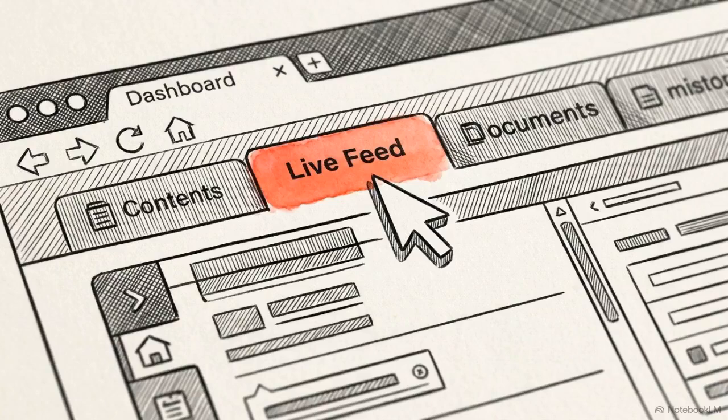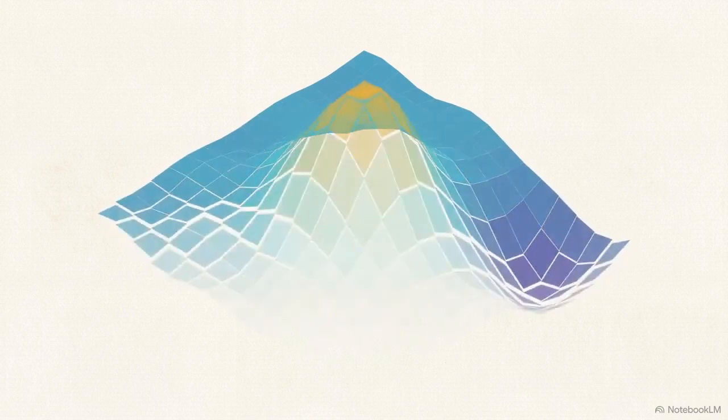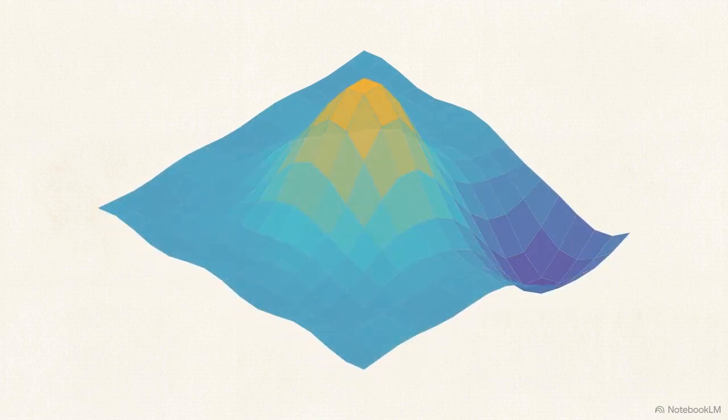Step 1 is transitioning the software from the dashboard to a live observation feed. On this toolbar, click the camera icon to activate the hardware, then immediately click the Live button right next to it. This topographical map illustrates why we need Z-axis mapping.